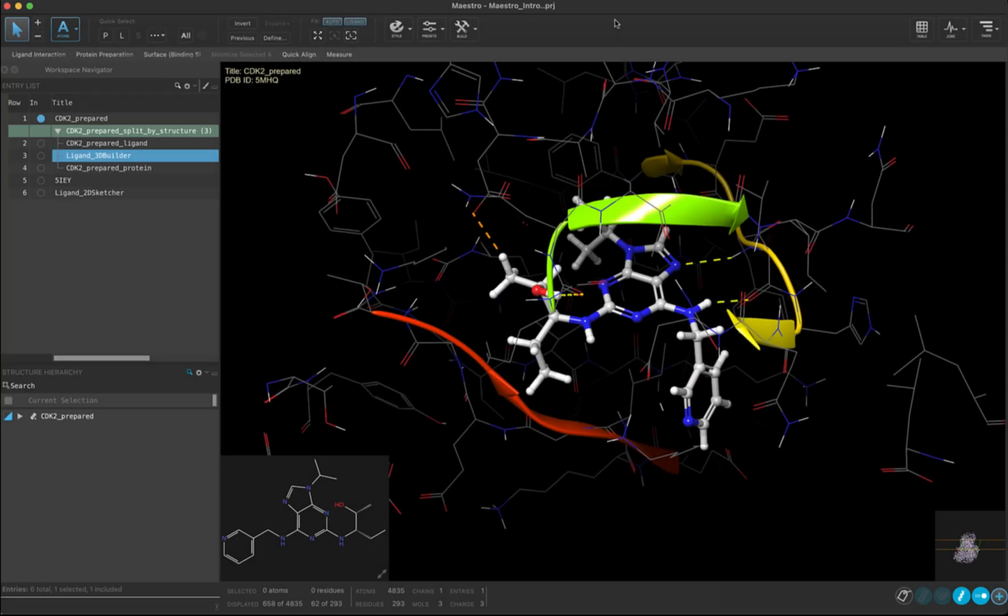Hi, and welcome back. Now that we have looked at importing structures, modifying small molecules in 2D and 3D, and our workspace toggles, let's move on to the structure hierarchy and surfaces.